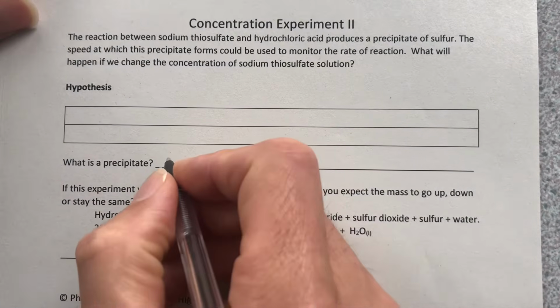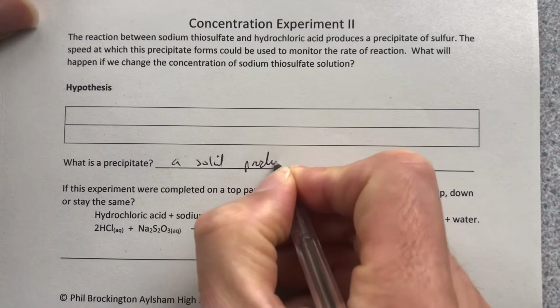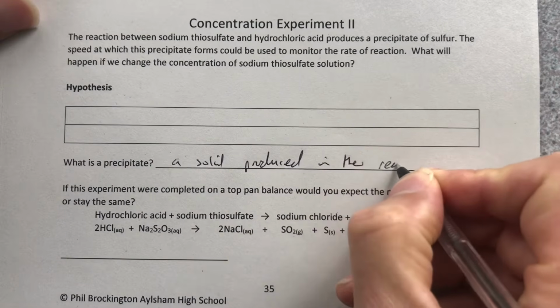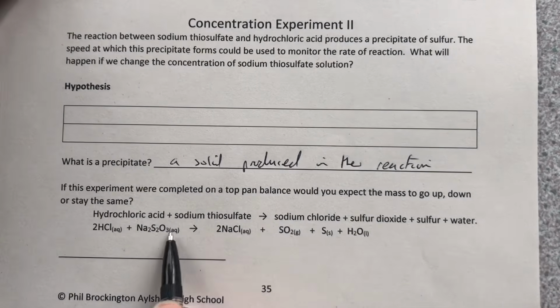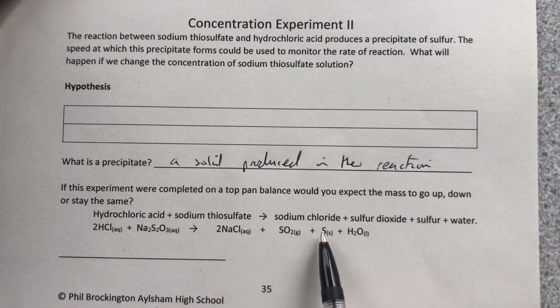A solid produced in a reaction is a precipitate. So what is a precipitate? A solid produced in the reaction. Now that will make the solutions go murky, go cloudy. Sodium thiosulfate, as you'll see in a moment, is a colourless liquid when it's aqueous and dissolved in water, and hydrochloric acid when it's dissolved in water is a colourless liquid. So two colourless liquids are on the left, but they produce this sulfur which is going to make the solution go cloudy.